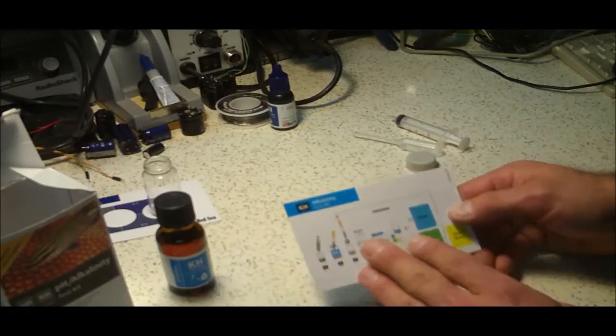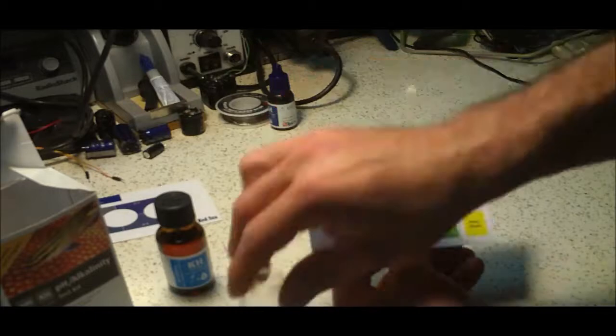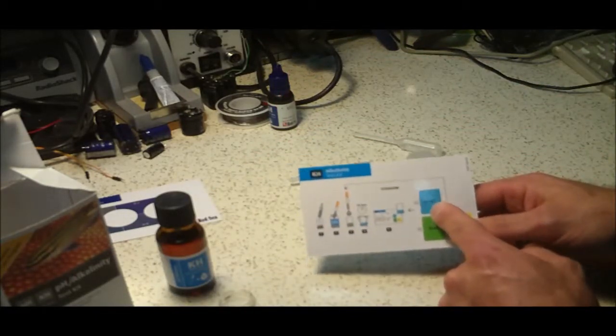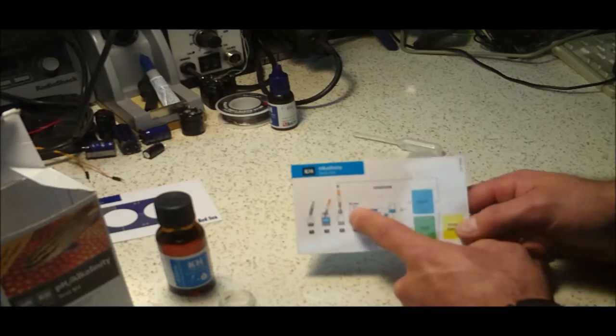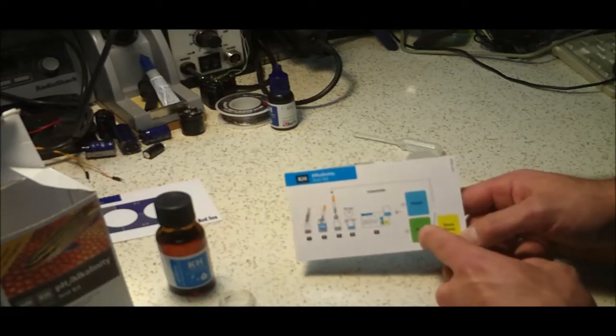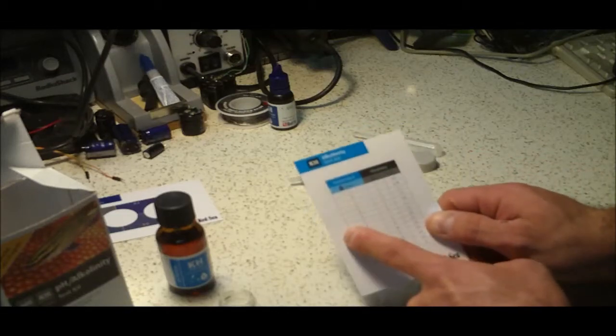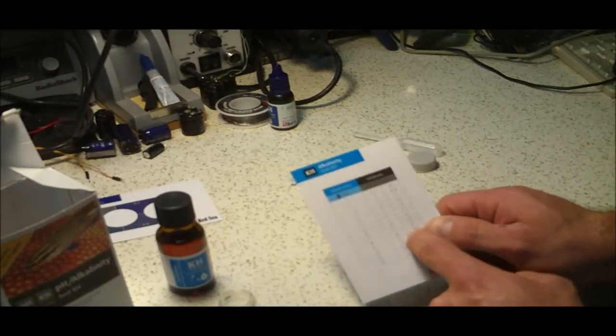The alkalinity, you put 5 milliliters of water again into the glass vial. You add a drop until you get it to this blue color. And then you add drops one at a time, shake it in between until you get this green color. Then you take the chart on the back, figure out how many drops you've used, and that tells you what your alkalinity is.